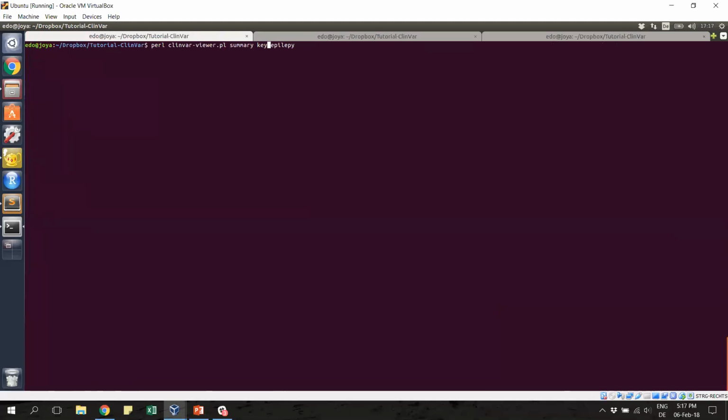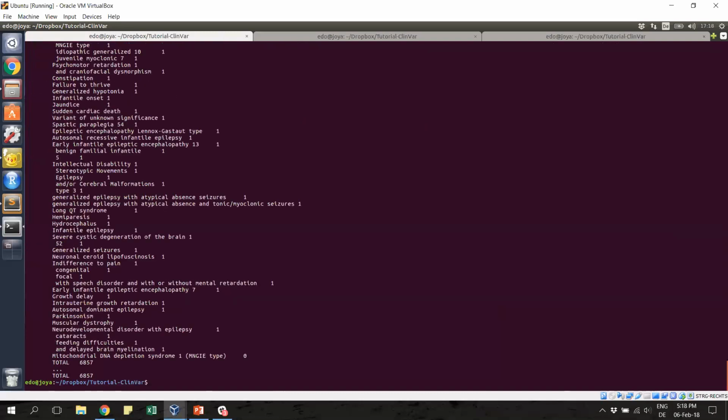I will try again, and this was working very well. Yeah, there it is.